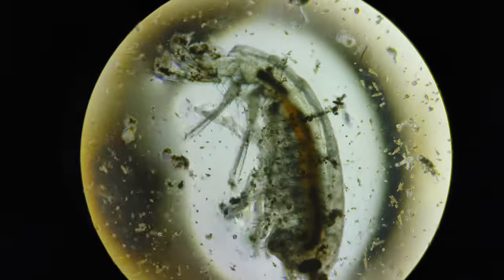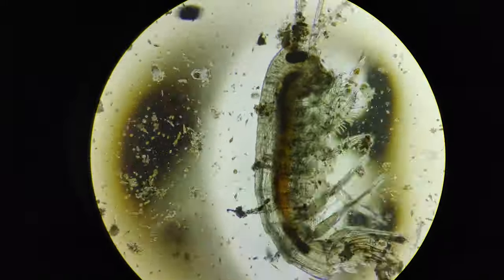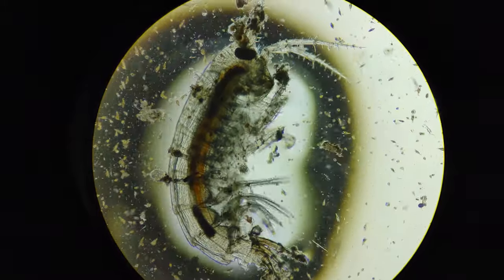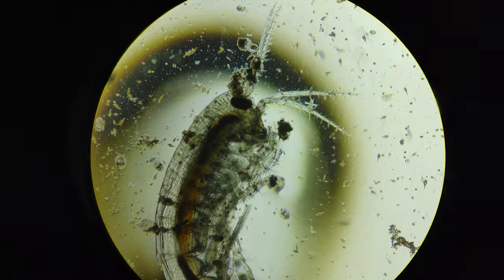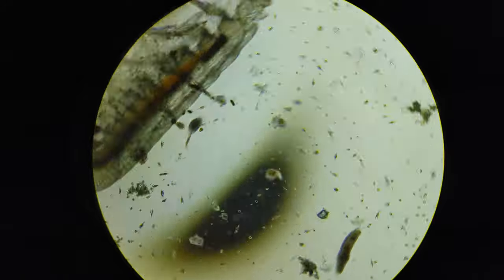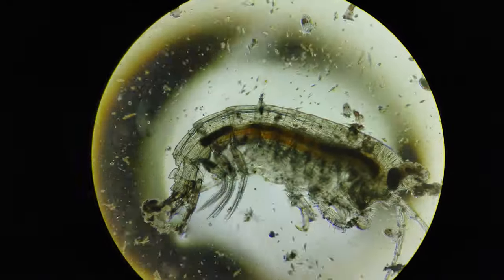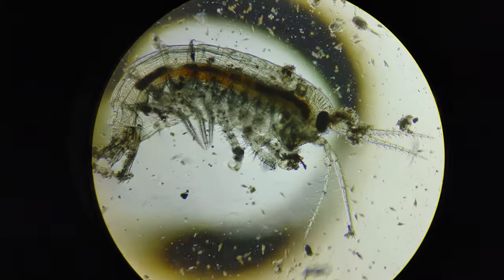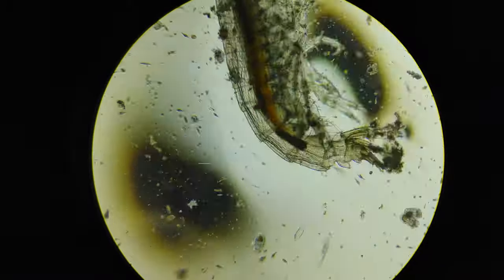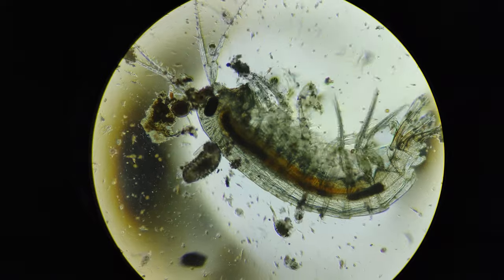Starting with the biggest organisms that I caught, this is an amphipod. Amphipods are crustaceans just like shrimp and crabs — this guy was about a quarter inch long. Most amphipods are scavengers and you can see this guy is actually collecting the plankton and bringing it to his mouth parts. I concentrated the sample by centrifugation so there's only a thin layer of water, which is why the amphipod is not able to swim very well here.